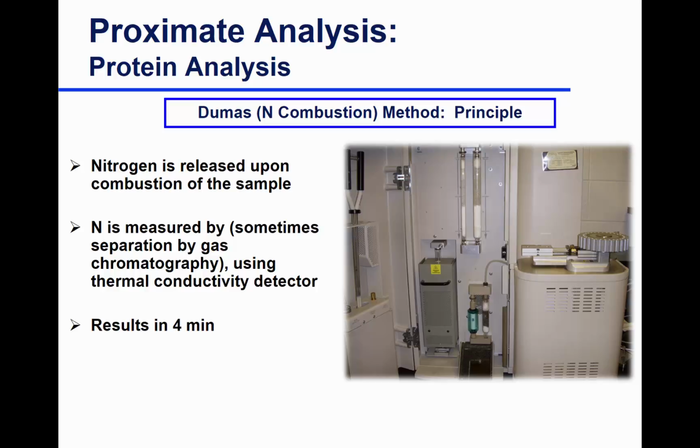Why do we need our sample as nitrogen? That's what we're measuring. Yeah, exactly, Molly. That's what we're actually detecting. And if you go back and review your GC notes, we talked about it in lab, how a thermal conductivity detector works. It's really important to have a pure sample, so in this case, pure nitrogen, being sent to the detector.